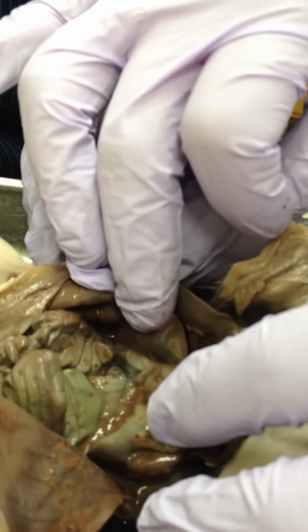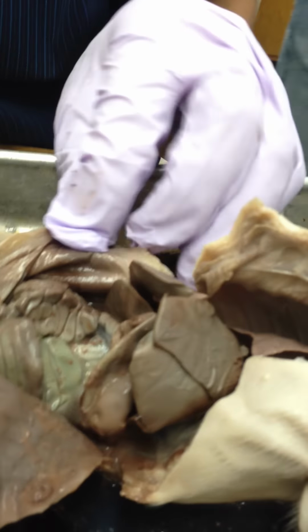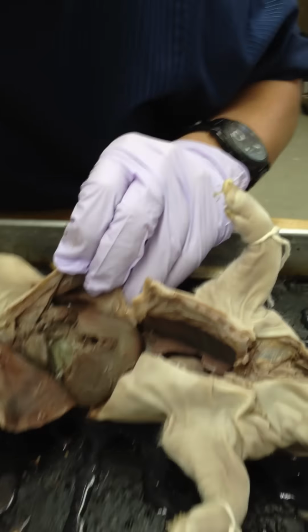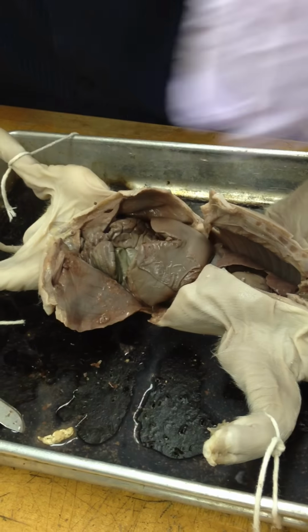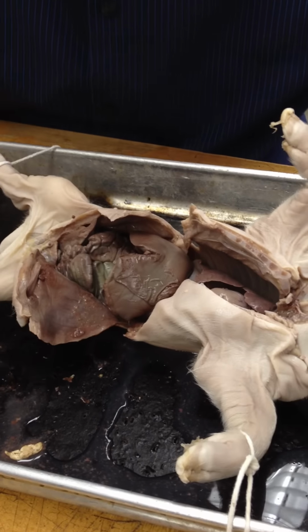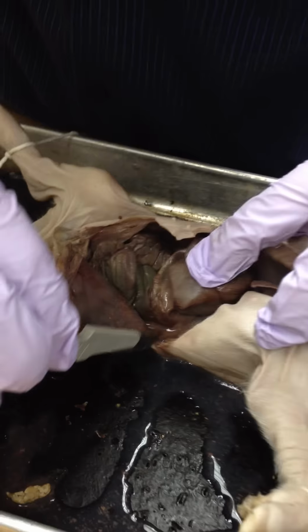And kidneys are in the back. I don't know if we're gonna be able to see them without cutting anything out. Let's just see, 48. That might be the spleen. Okay, let's try this. That is the spleen. Yeah, that's the spleen. Yeah, it seems like it.